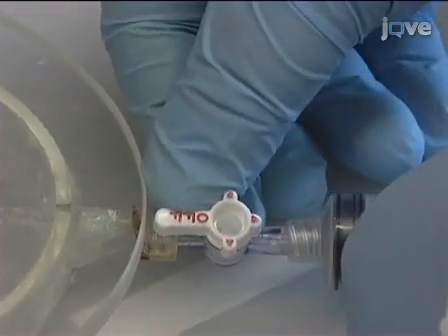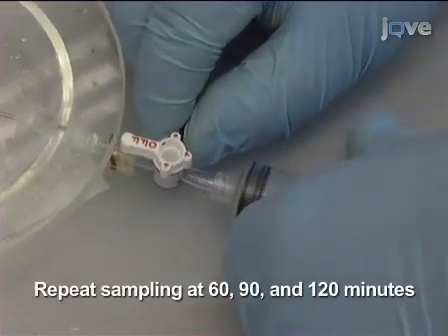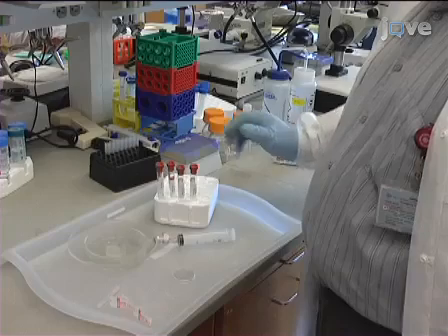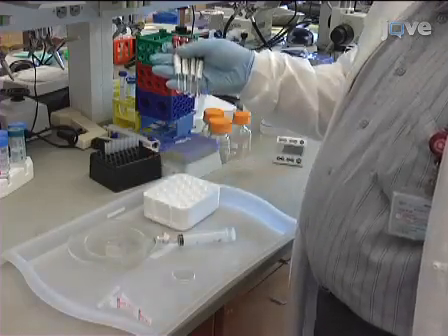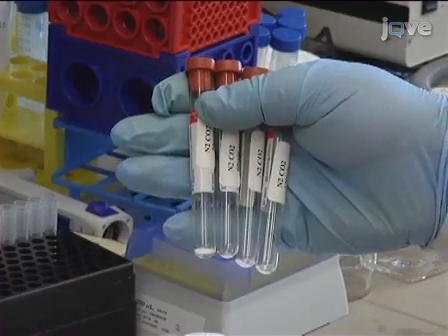Next, inject 10 milliliters of air into the glass chamber through the 3-way stopcock using a 20 milliliter syringe. Close the stopcock to the chamber after re-injecting atmosphere and before resuming incubation. Repeat sampling of the atmosphere from the glass chamber at 60, 90, and 120 minutes. Analyze these atmospheric carbon dioxide samples for labeled carbon enrichment using a gas ratio mass spectrometer as described in the protocol text.